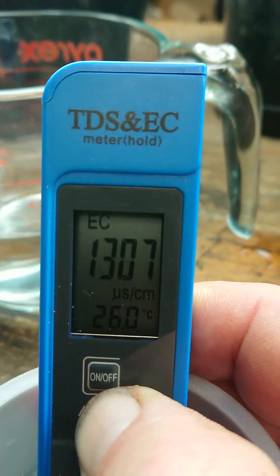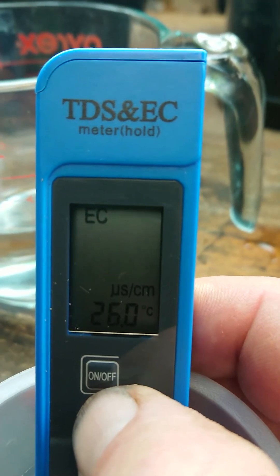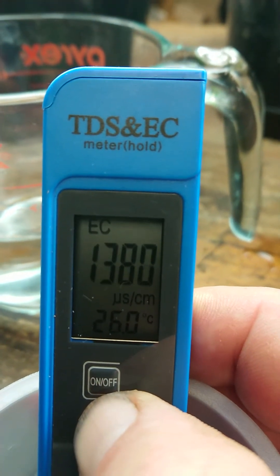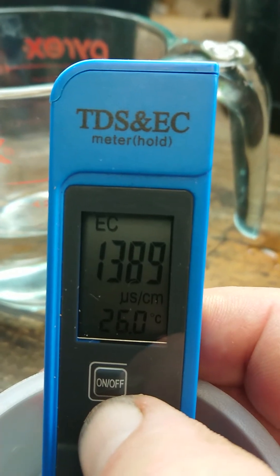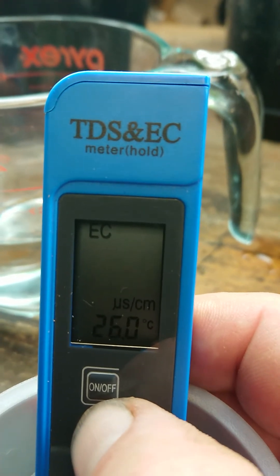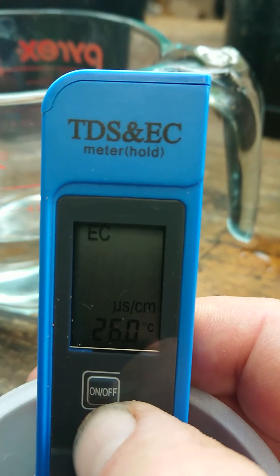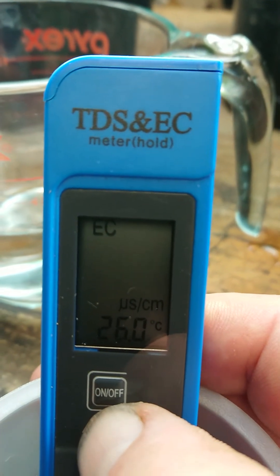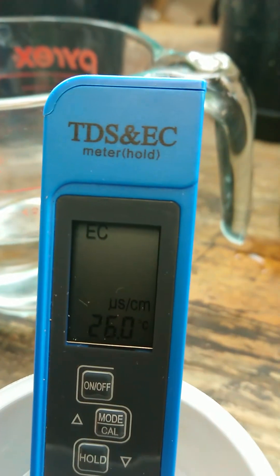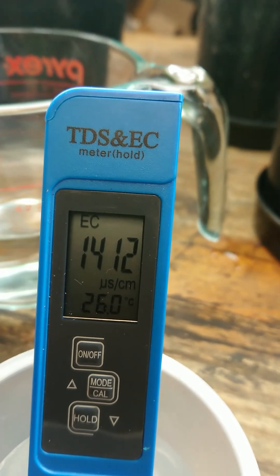It's gone too far again. I suggest you do it in small bursts until you get close. Getting close now — I'm going to go in individual clicks to get to 1413.